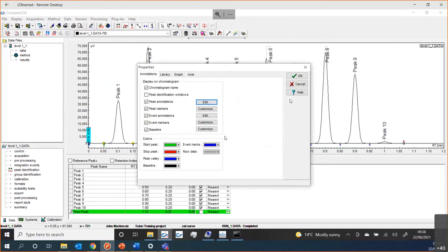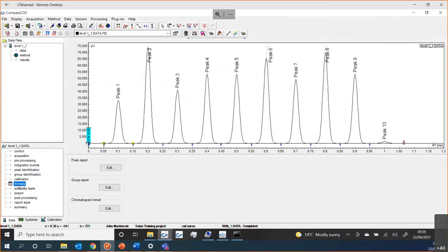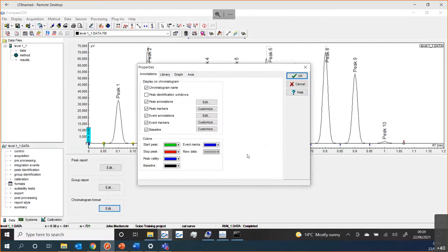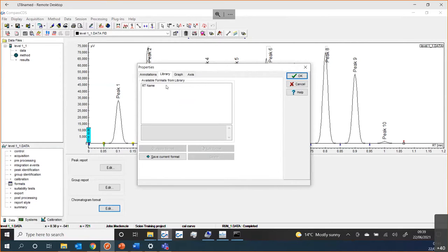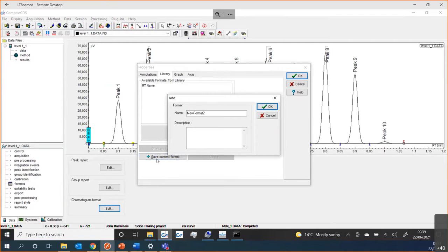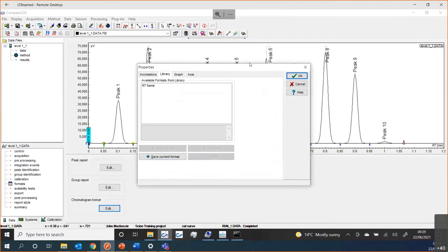Not only that, once you have made these changes and you're happy with how the chromatogram looks on screen, using the Formats function I can then just save that to a library. I can save the current format, give it a name, and I can then apply that same format to my report style or in other places where the chromatogram is visible.